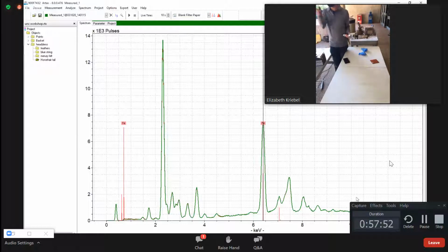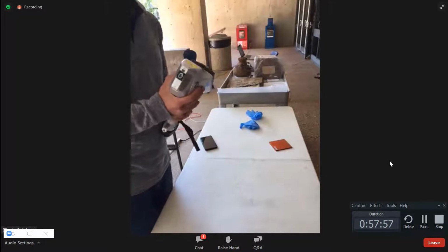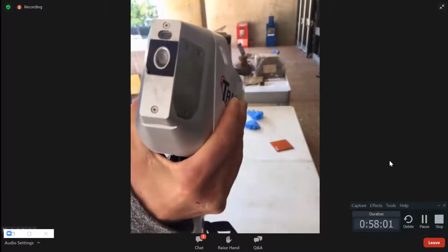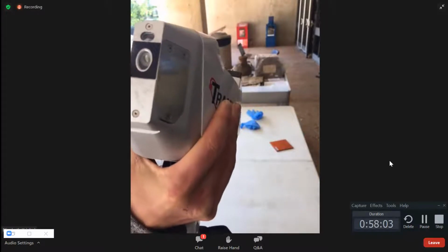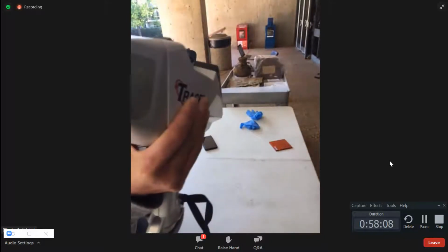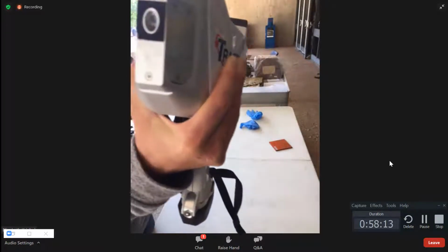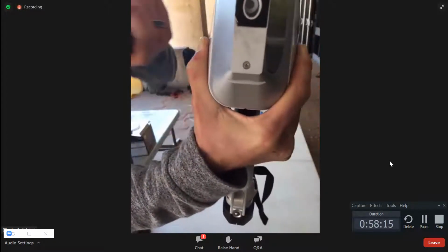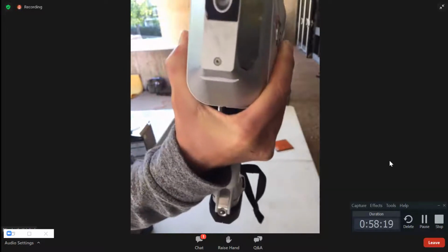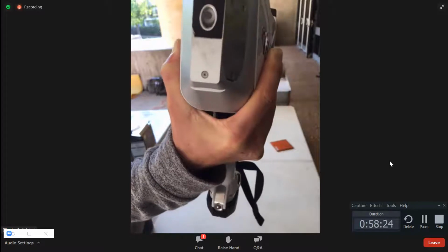Oh, sorry. Thank you. So I'm going to get in close here. Can you see the window okay? Yes. If you see the clear window there, as long as this is sealed, all the internal components are going to be fine. If this is ruptured and you've got any kind of powderized material, you do risk contaminating the detector. Keep in mind the plastic here is only 4 micrometers of Prolene. It's extremely thin and easy to tear, so you do want to monitor that.